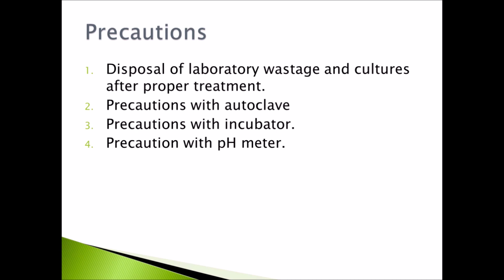If the tubes are to be incubated for a long time or at higher temperature, the medium may become too dry due to excessive evaporation. In such cases, cotton plug should be pushed inside the neck of the tube. The tube should be covered by a rubber cap so as to cover the plug.